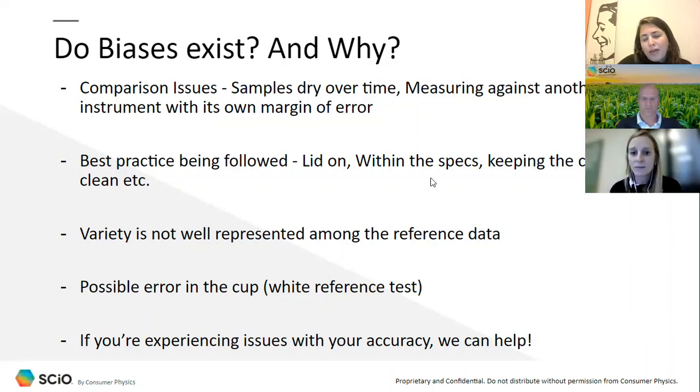So let's say you haven't put the lid on when measuring, or you're measuring at a temperature that's outside of your specifications, or you haven't kept the cup clean. These can all impact your results and can result in a bias.